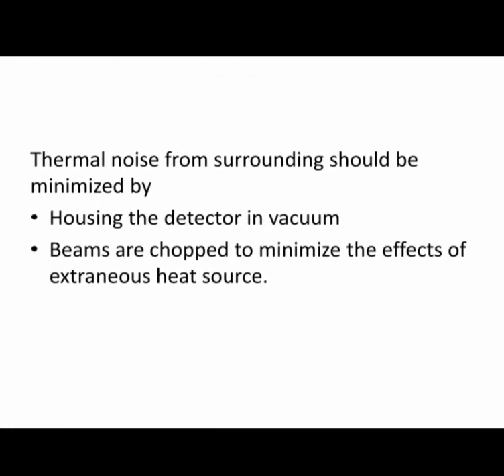Thermal noise from the surroundings should be minimized by housing the detector in a vacuum, and beams are chopped to minimize the effect of extraneous heat sources.